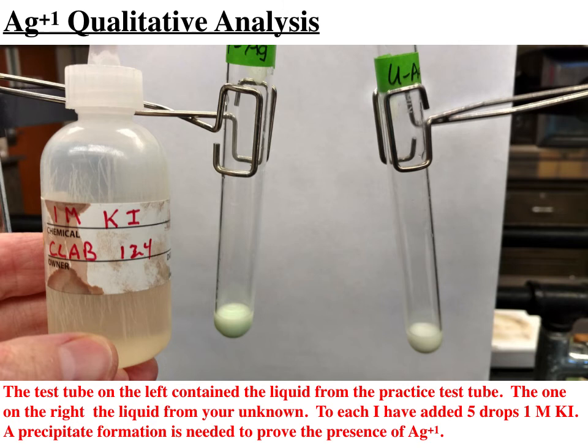Here's what happened to my test tubes. One, of course, my practice test tube, the other my unknown test tube. What I did was I added some ammonia to the precipitate that was left over from the separation with the lead, dissolved it all, crunched it all up, got it all into solution. Then I added KI into each test tube, and we see a resulting precipitate. You are supposed to use this information in order to determine whether or not your unknown sample contained silver cations.